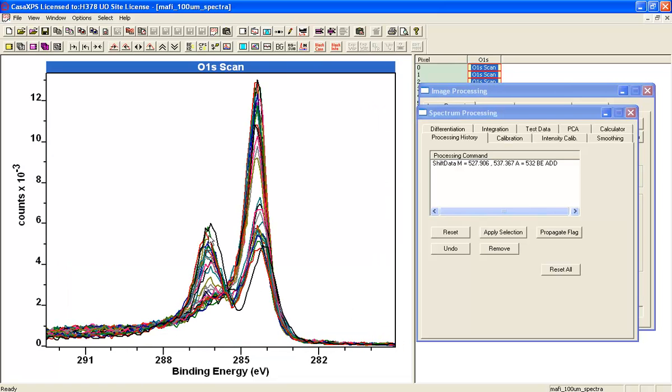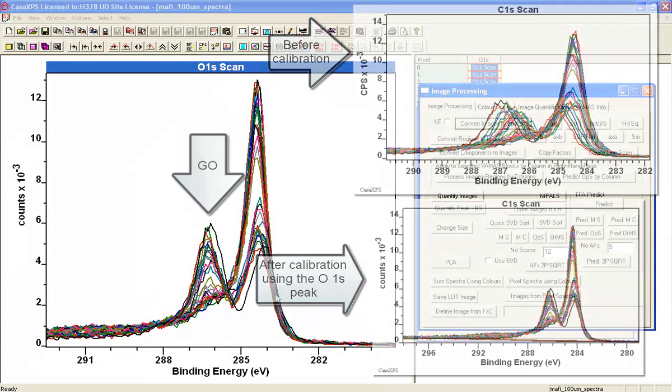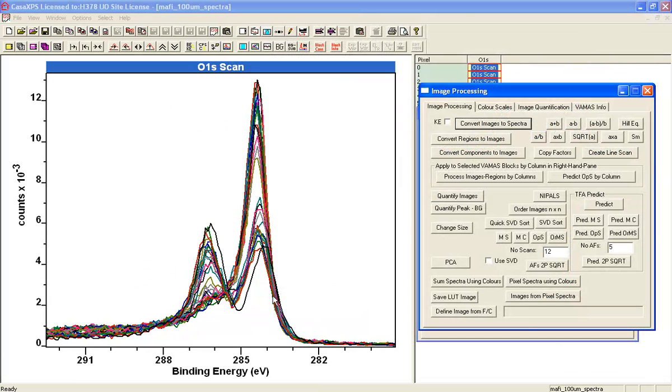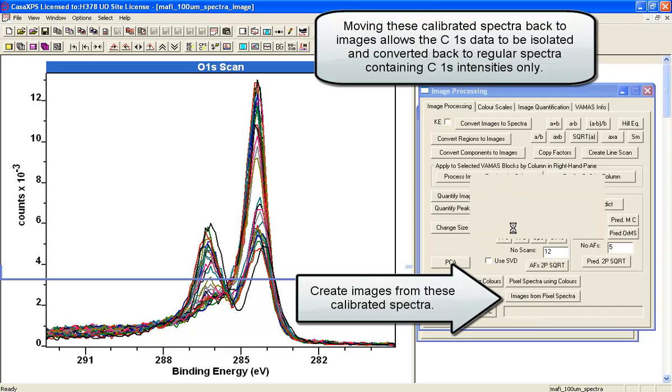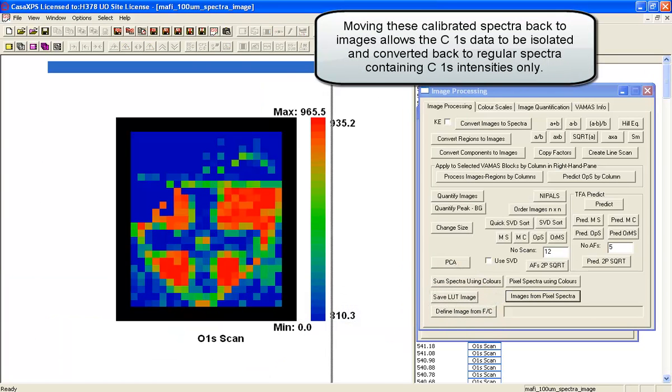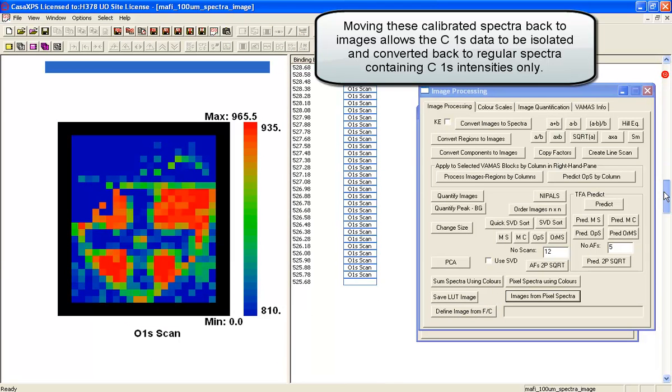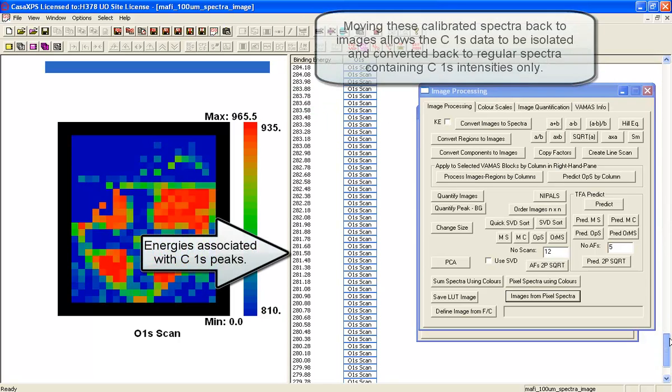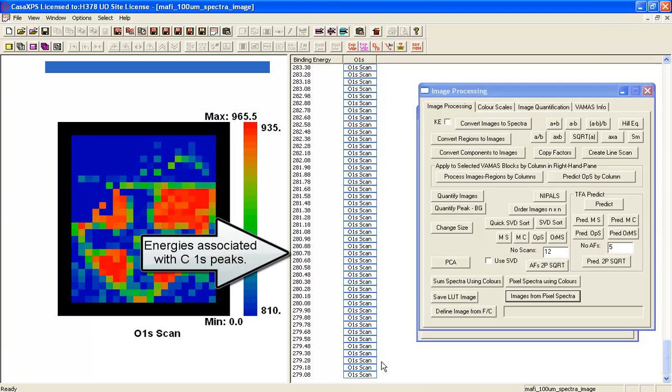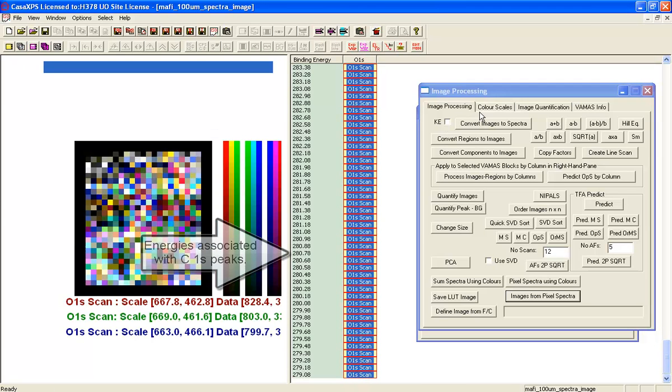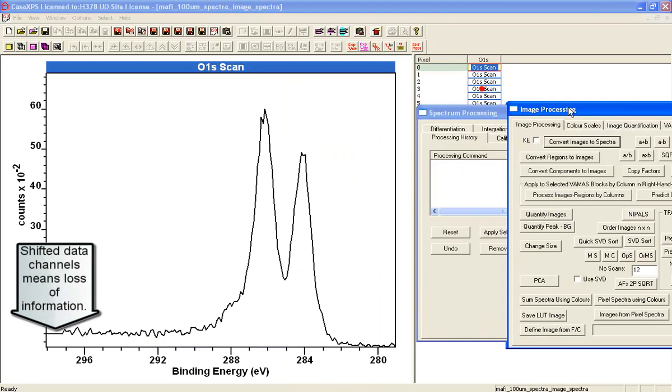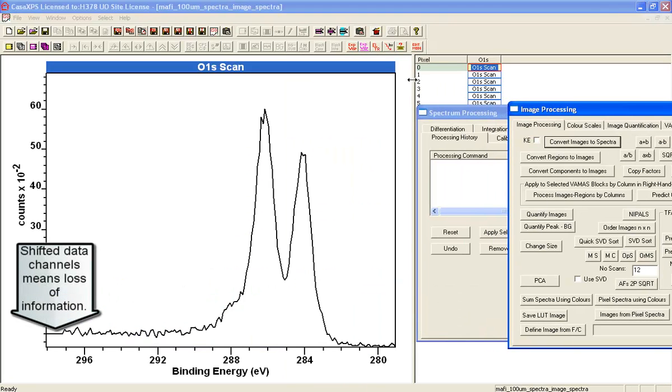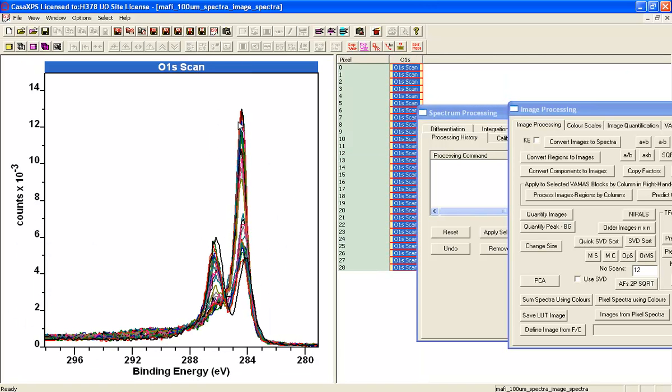We now see that the graphene oxide—a peak here which is characteristic of the graphene oxide—they're far better aligned than they were before. One further step: if I wanted to isolate the carbon 1s again, I'm going to create these images from the spectra, and this time I'm going to select out where I find the energies that correspond to carbon and create spectra from these. Now I've got a data set that has got energy aligned graphene oxide peaks which I can do further processing on.